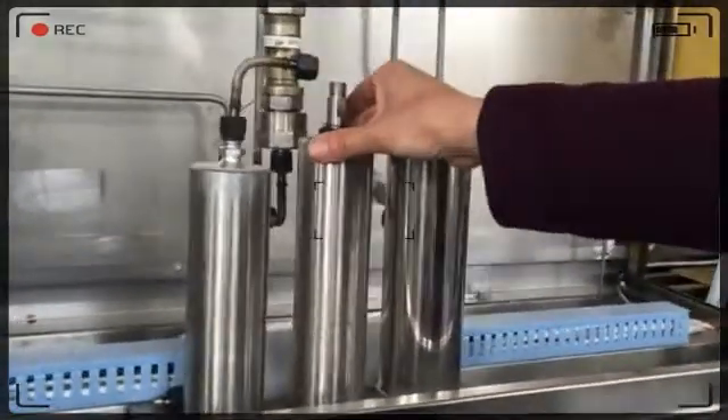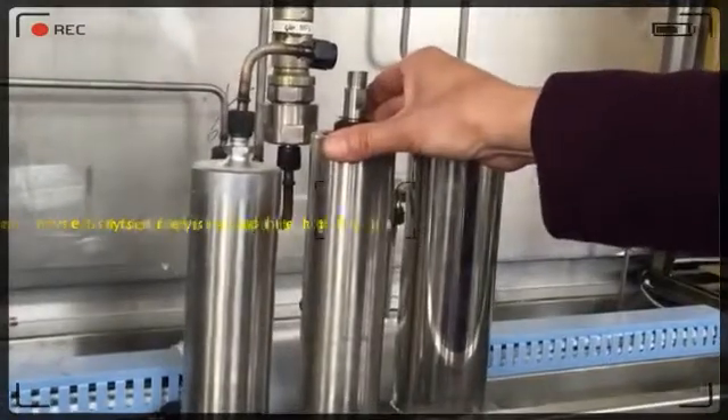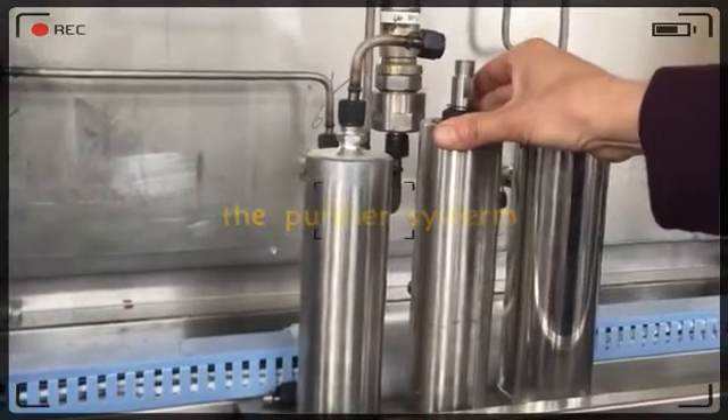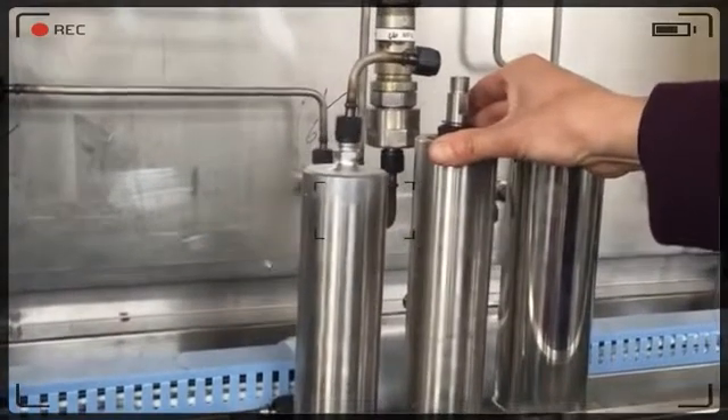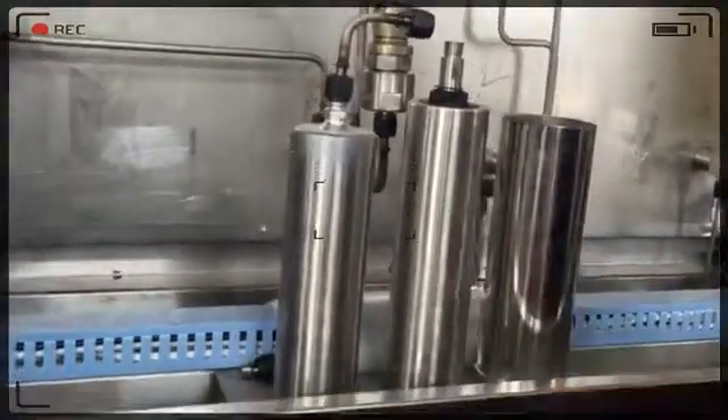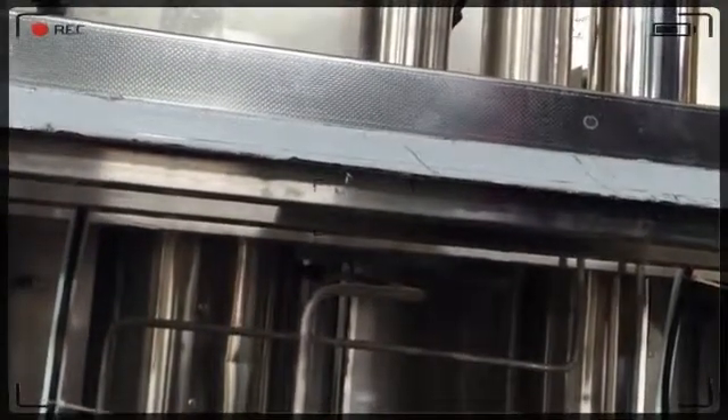This is the purification system. If there is some water in the material, or there is some water in the CO2, we can ventilate the extra water out by adding a pipe.